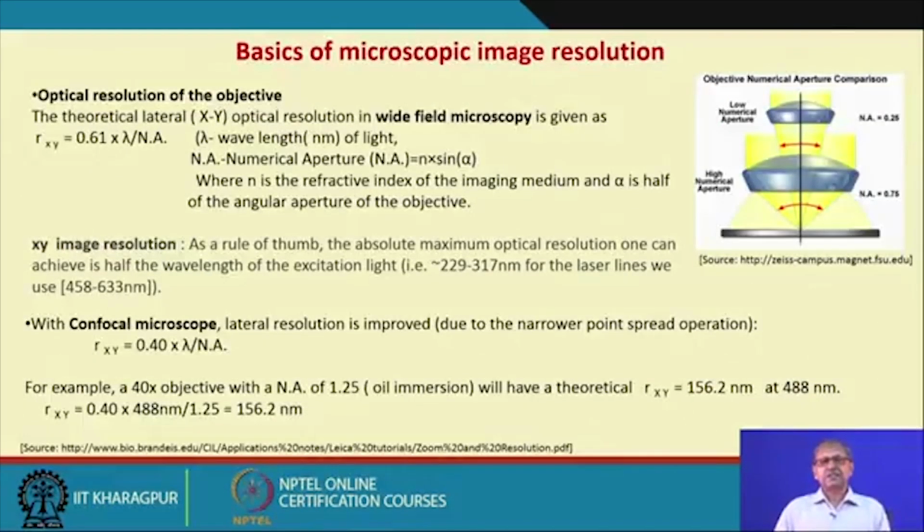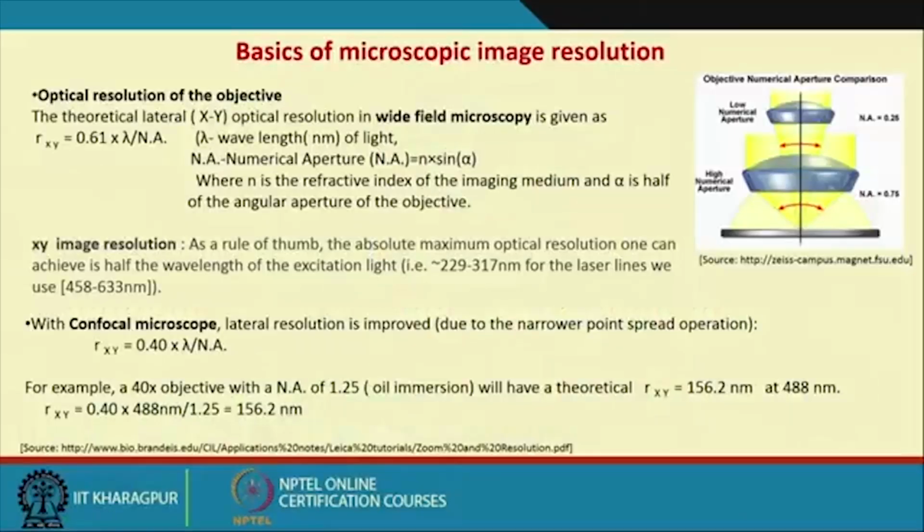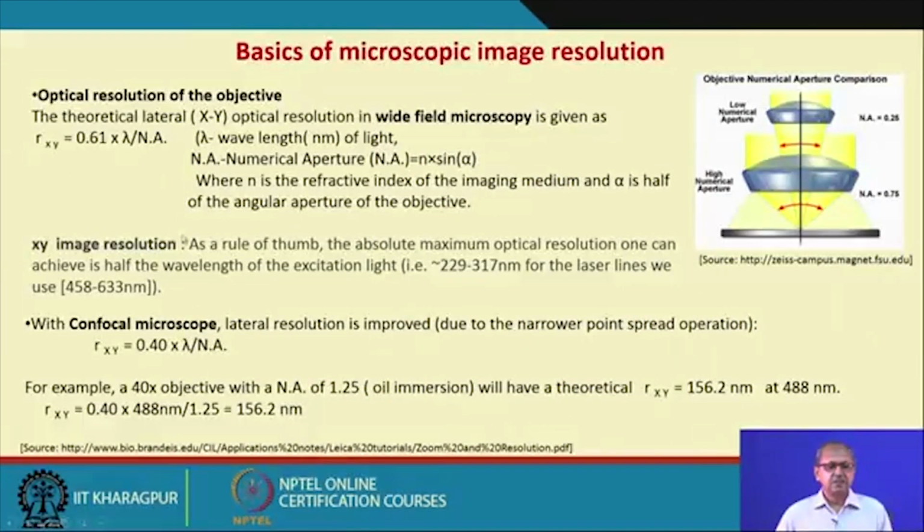So, as you are telling about resolution, what is resolution? Image resolution in microscopy. Optical resolution in theoretical format: we are discussing mainly the lateral XY plane optical resolution in wide field microscopy. This is represented by Rxy equal to 0.61 into lambda by numerical aperture.